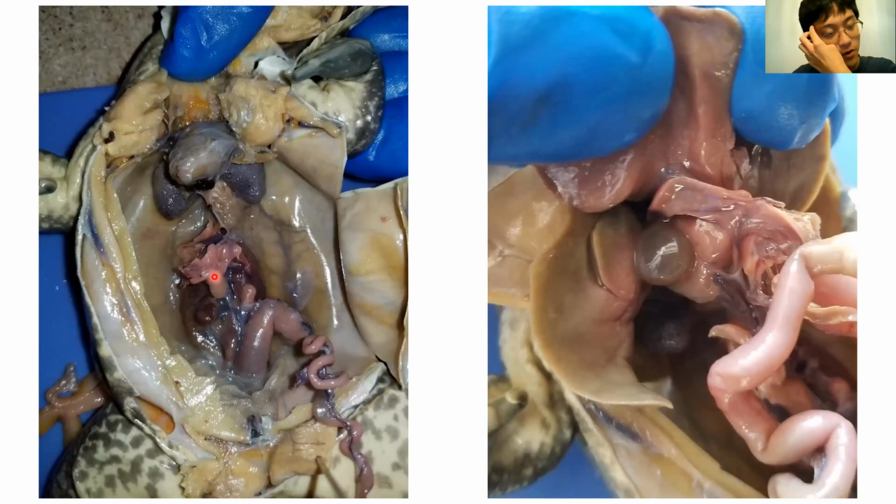So frogs do have pulmonary respiration, but as you can see, these are the lungs, that's the heart. Especially looking at the lungs, it's not really what they're specialized in, so they're kind of small. I mean, the heart's larger than them. The heart itself is covered in a pericardium or pericardial sac.